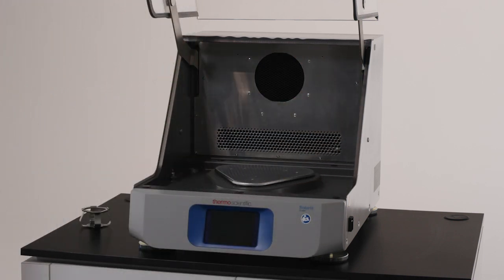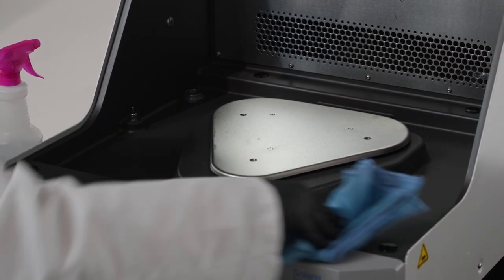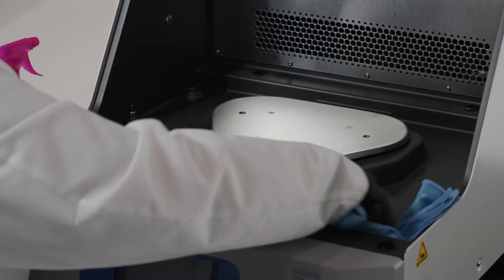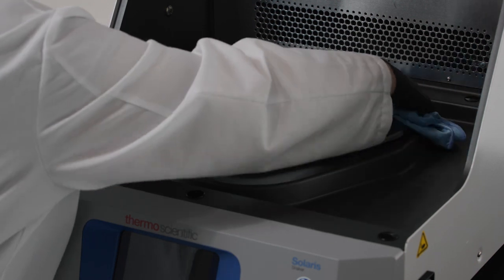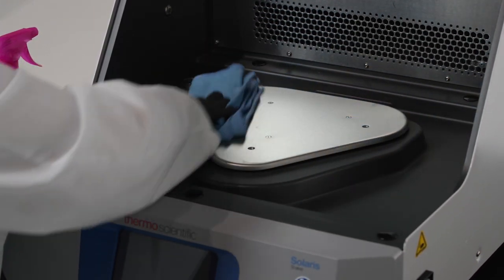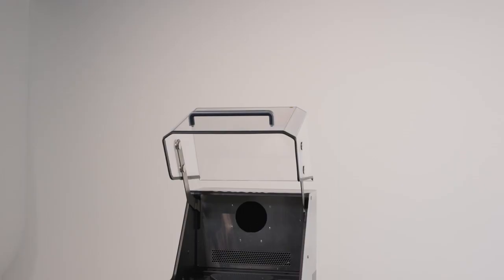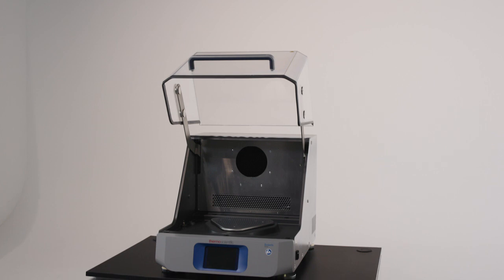The shaker and platform were designed with rounded corners to make the cleaning process easier. We recommend cleaning the shaker platform and surface with a mild soap and water. A 70% ethanol solution can be used to wipe down and disinfect surfaces as well. Please allow the shaker to air dry with the hood open.